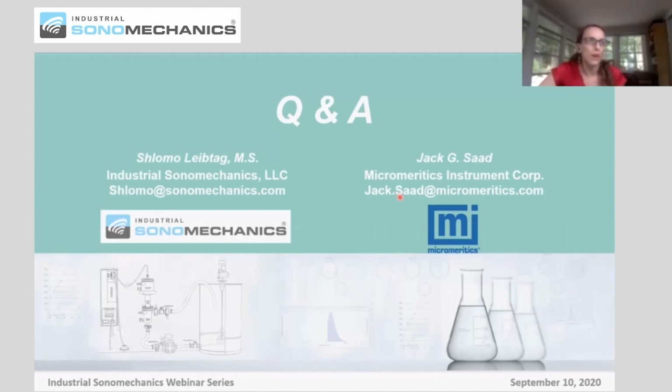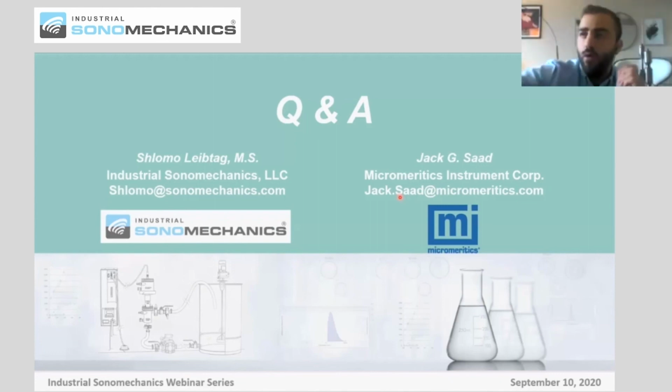So the first question I have is, how does an ultrasound mixer compare with high shear mixers? Yes, so ultrasound is actually providing high intensity mixing. A high shear mixer can't provide the same intensity that you're able to provide with high intensity ultrasound, so you won't make very fine droplets. And if you can't ever form the very small droplets, then you can't sustain them.